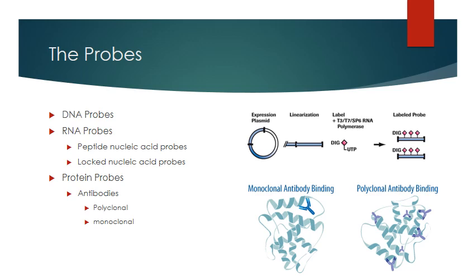Okay. Your RNA probe, once you produce it, is not as stable, and so it's going to have to be used within a few days of production. And of course, you have to add that step where you remove that DNA template from the probe. As long as you have an RNase-free DNase, you can do that pretty easily.